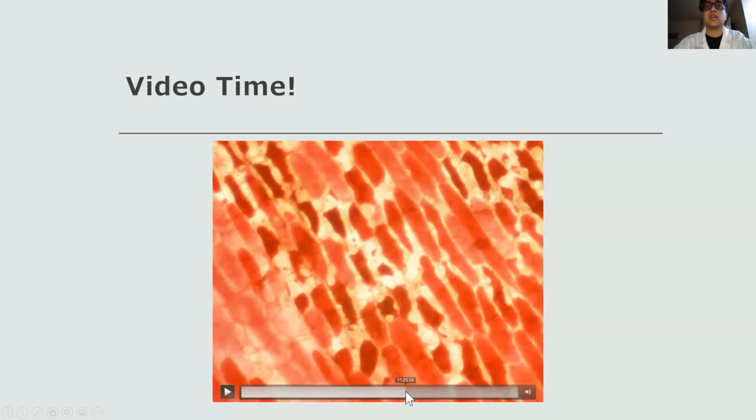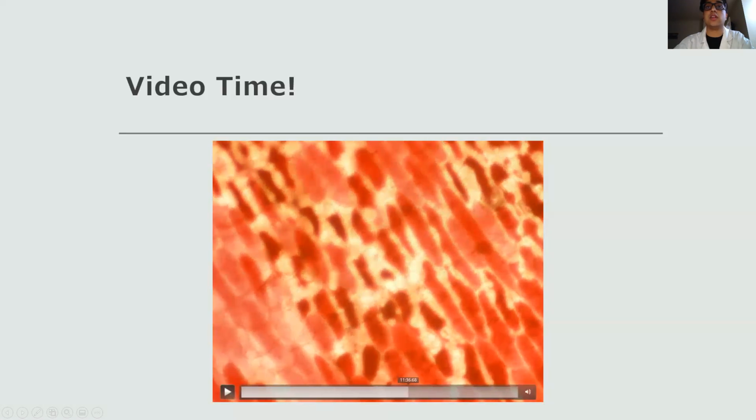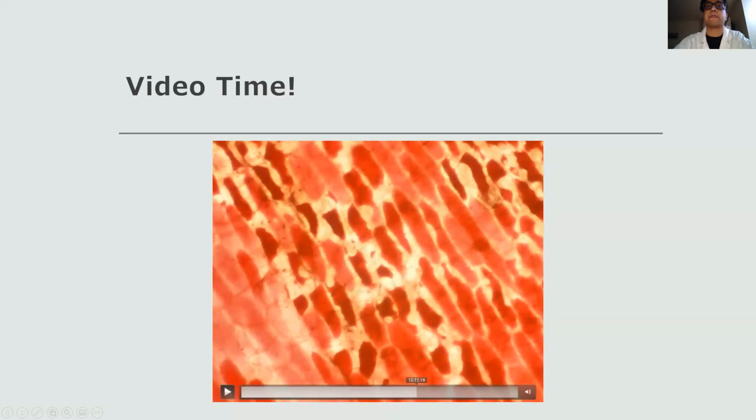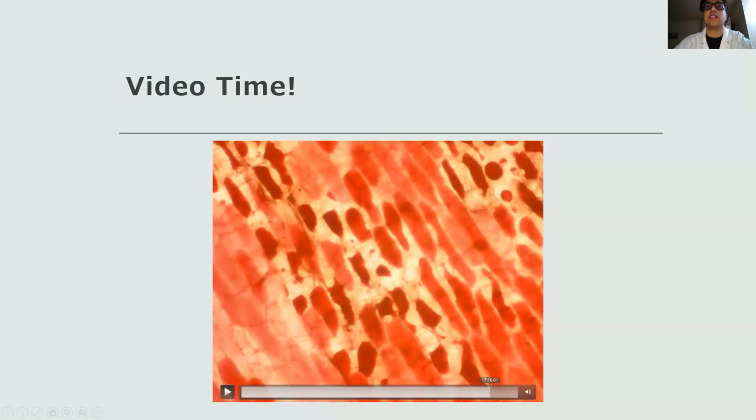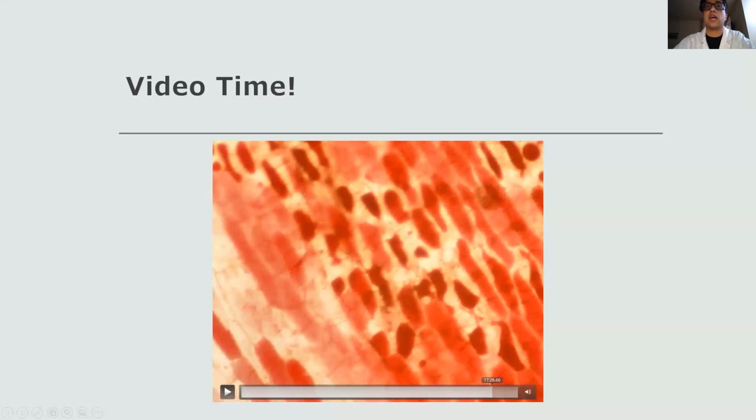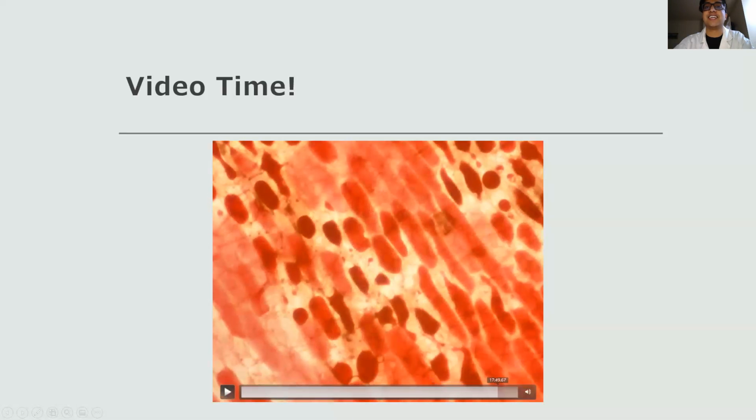as we progress. Now here, actually, the student adds the 15% salt solution. And as you can see, slowly but surely, actually, I don't think they've added it just yet. There we go. It looks like they added it just then. They've added the 15% salt solution onto the distilled water. And it looks like they had a slight error where the slide might have moved.